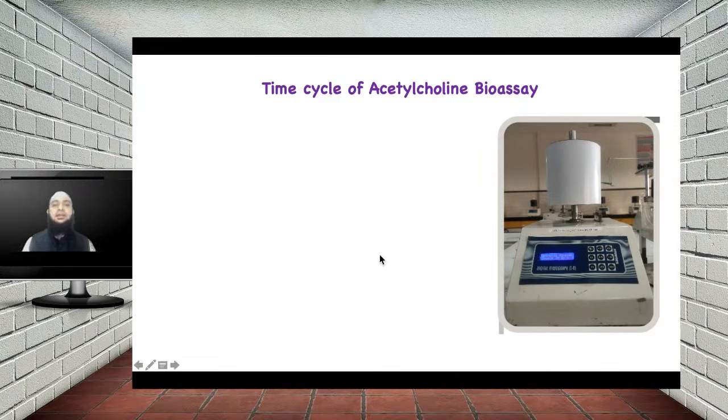Okay, so now we'll see the time cycle of the acetylcholine bioassay, and let's see what the different parameters are. Obviously the first thing is the baseline, which we are taking for 30 seconds. I'm repeating this for every experiment so that you must remember it and no one should forget this basic thing, because we have to maintain it constant throughout the experiment. If you are not keeping this constant, then you may not get a proper result of the experiment.